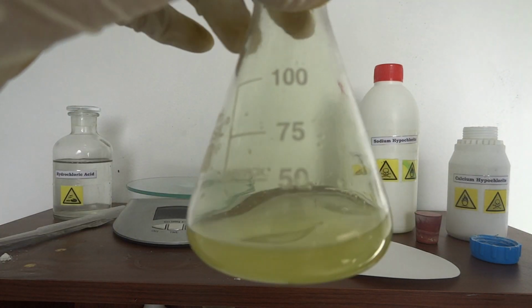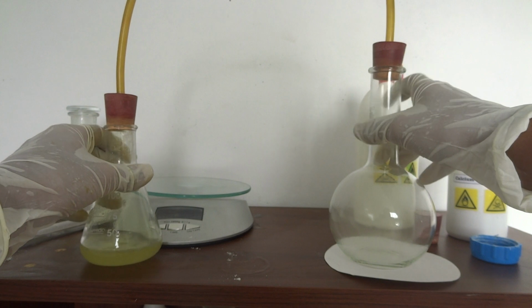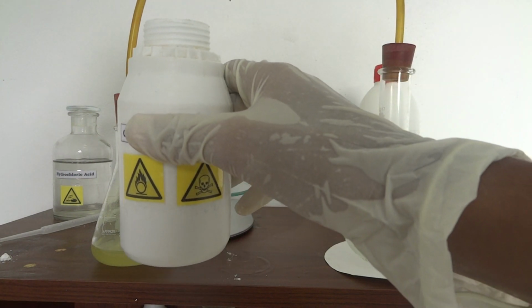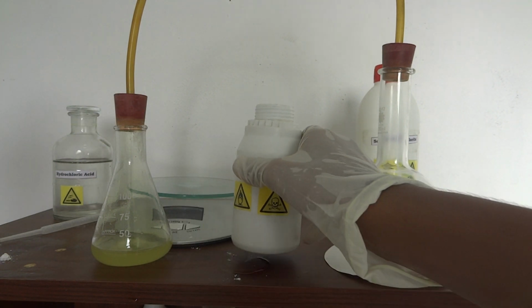This pale yellow-green gas is actually chlorine gas, and see, some of it has collected into a flask. Let me add another scoop of this, because we have a lot of acid remaining.